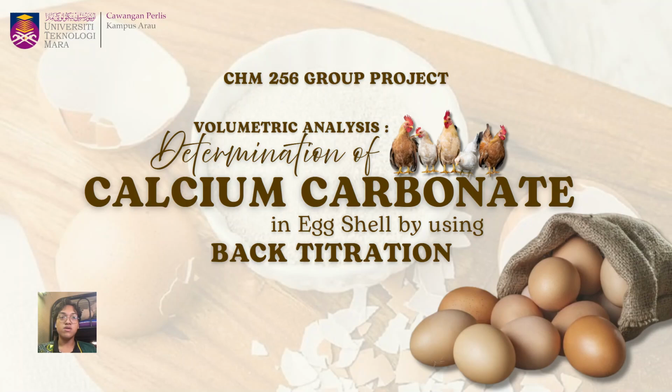Today, regarding group project CHM 256, we chose volumetric analysis to determine calcium carbonate in eggshell by using back titration.